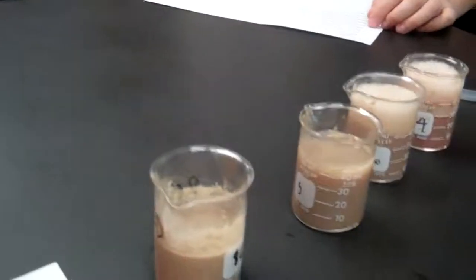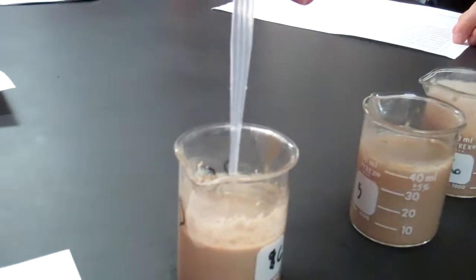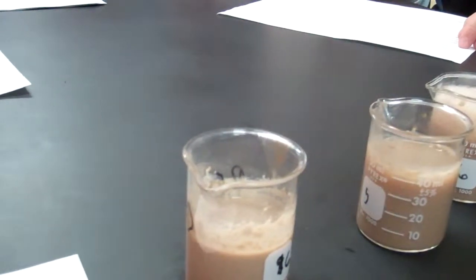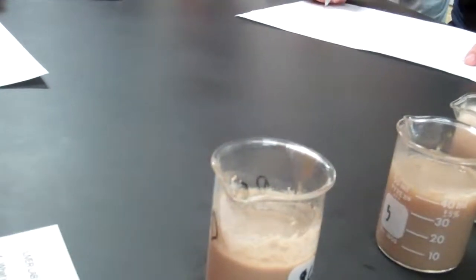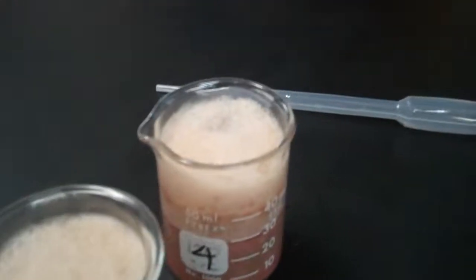Didn't that like already tell us what was gonna happen in another lab? Did it? Because the boiling got rid of the enzymes. Let's see what happens. I like his answer. Ready? Oh my god. Absolutely nothing. It released the smell. There was no reaction.